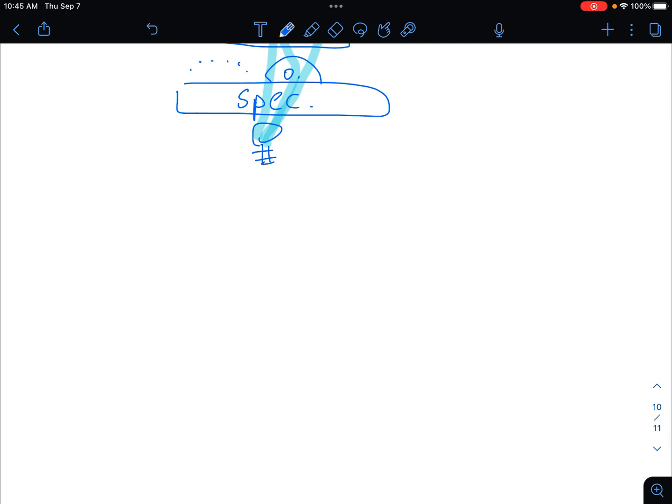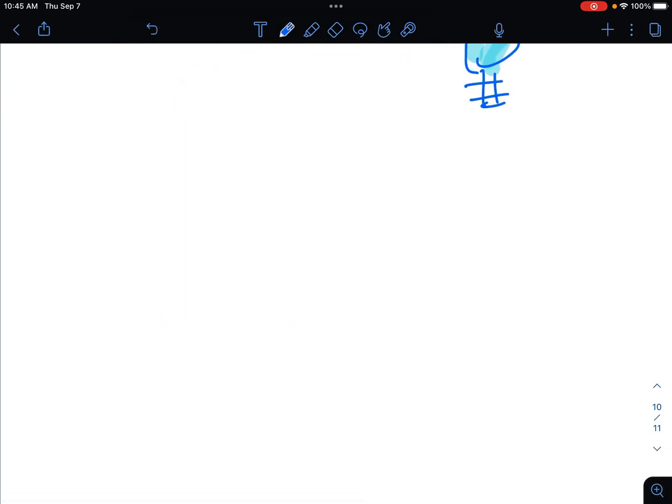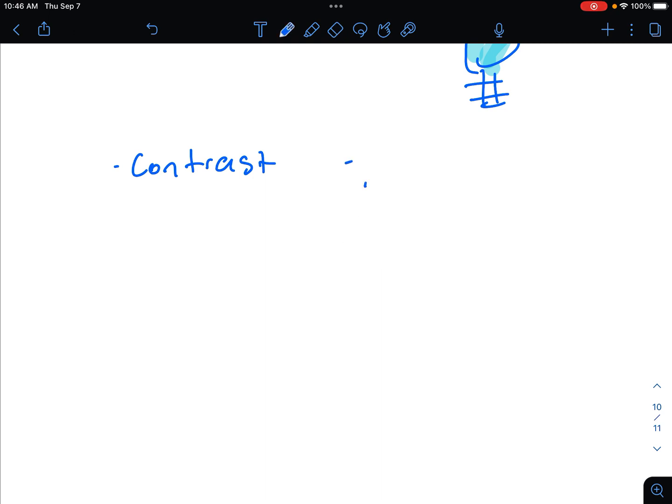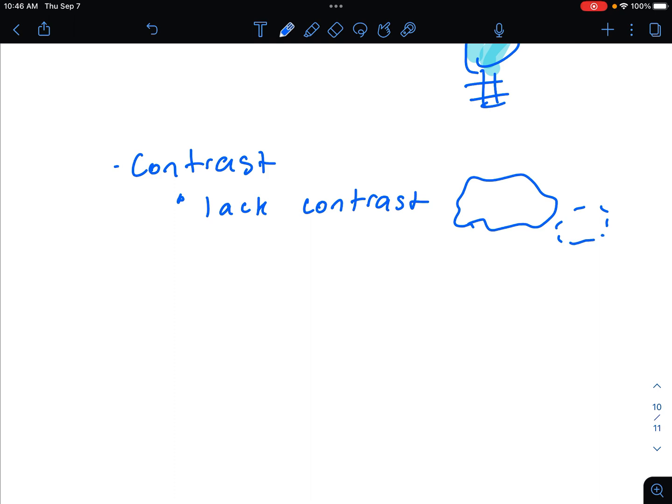Another principle that's very important to talk about when talking about using the light microscope is contrast. How different are the objects compared to the background? So maybe something like this, let's say the bacteria are these dots. That's little contrast, but if we had something like this, those are microorganisms, that's a ton of contrast. It's again how easily the cells can be seen. Most bacteria will lack contrast. There'll be these gelatinous kind of ghost-like shapes, kind of like that as well.